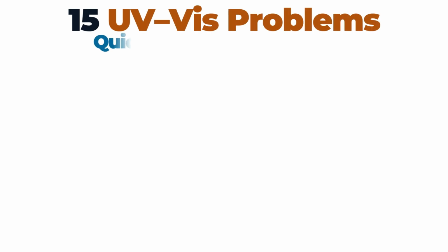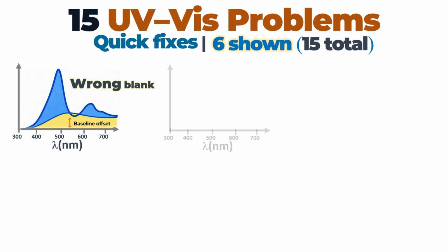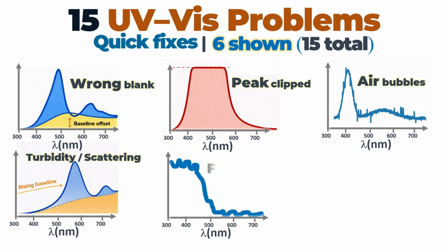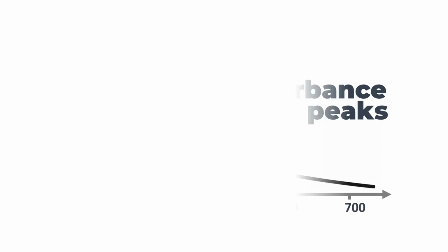If your UV-Vis looks like any of these, it's probably a setup issue, not your sample. In the next few minutes, I will show 15 real problems, what they look like, and the fastest fix for each. Same sample, different form.